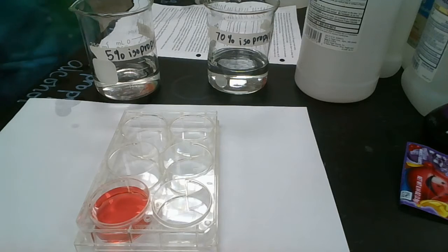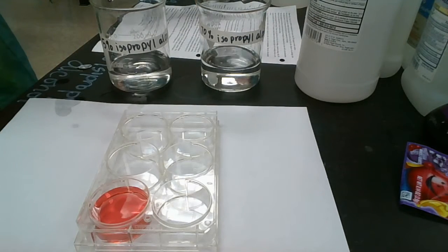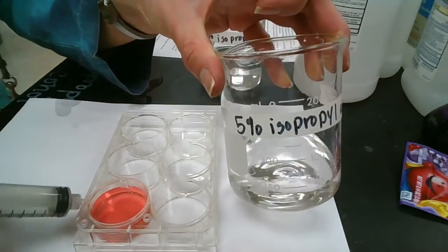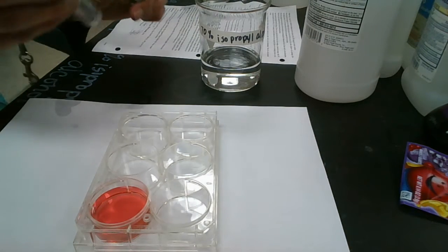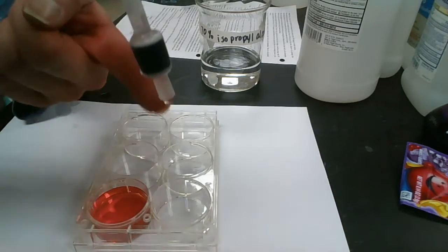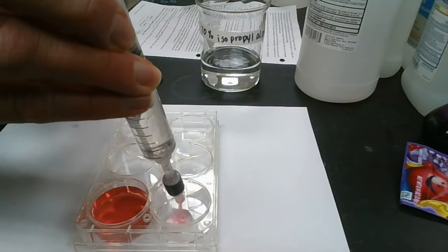So we're going to go ahead and switch to 25% isopropyl. We were at 5% isopropyl, which drew off the red compound. We're going to switch it up to the 25% isopropyl. And when we switch it up to the 25%, we're keeping the orientation of the column the same. I've got this short end of the column on the bottom, keeping the orientation the same.